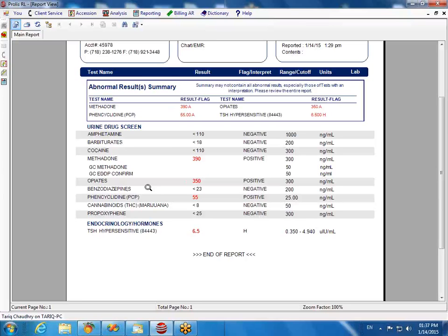That's just the metabolite of methadone. That's why it showed up. If we enter the result here, it will show. Yeah. No, but why this test was not shown on the resulting screen, that's what my concern is. Yeah. And I'll show you why it was not there.